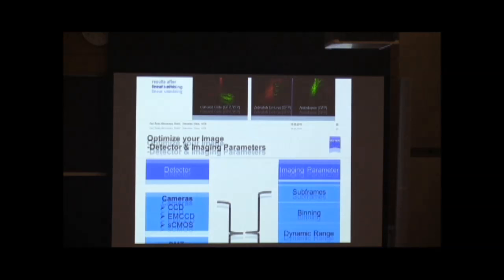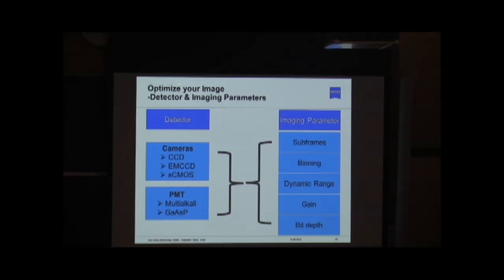Next topic that I would like to start is detector and imaging parameters. And as both topics are actually quite related to each other, I kind of combine them within the next couple of slides. So let's first talk a little bit about the detectors.